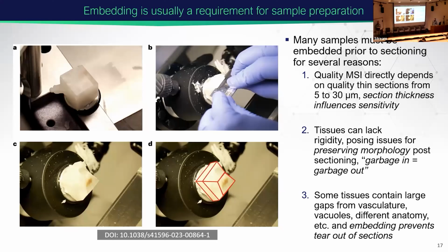And in plant tissues especially, there is a big problem compared to, let's say, when we section mammalian tissues, which are quite easy to section even without embedding. They have a lot of fat there, and sectioning just goes smoothly. I'm talking about, let's say, kidney, liver, not about bones and those kinds of things.